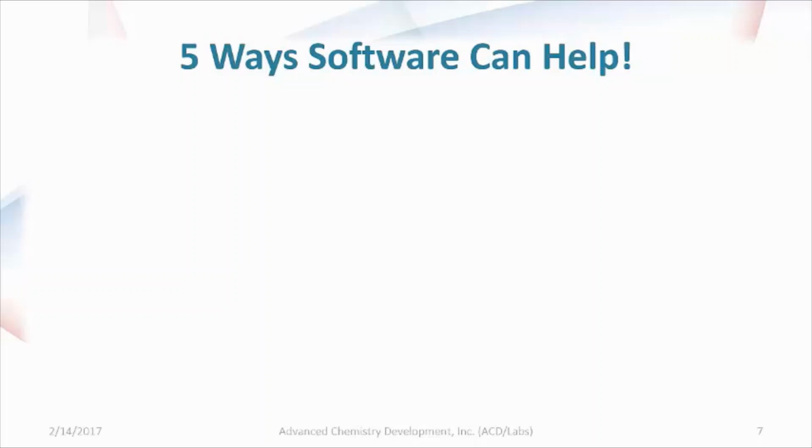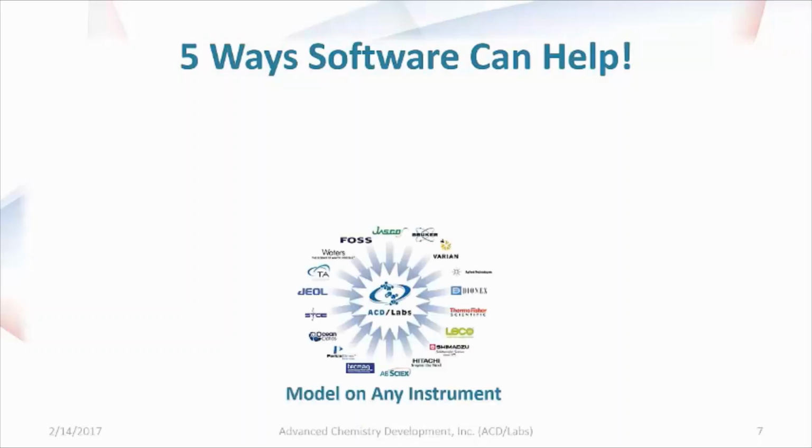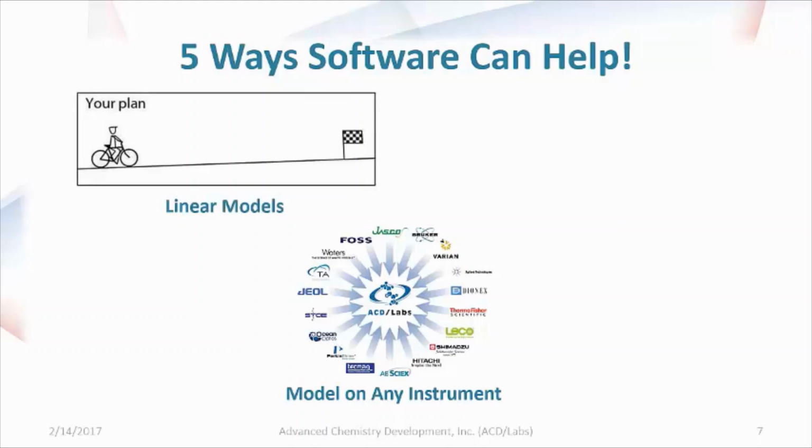So the purpose of this webinar is we wanted to mention and highlight how software can help you with your particular method development. The first point that I would like to hit on is at ACDLabs we provide a vendor-neutral platform to perform any of your data analysis. So you can create methods on any of your HPLC, and then you can model and create models. It does not matter on whatever instrument the data was collected. You can make a model for separation for that particular instrument.